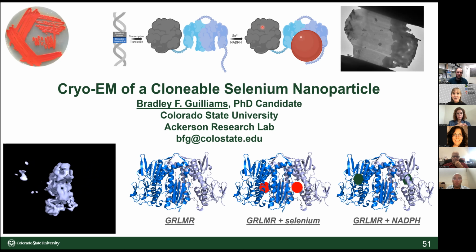Yeah, I think what I have gleaned thus far is I'm not limited by pixel size. Like I'm not at the Nyquist limit. I think looking at the FSC curve and that graph that spits out will tell you a lot about some of the things limiting your resolution, maybe.